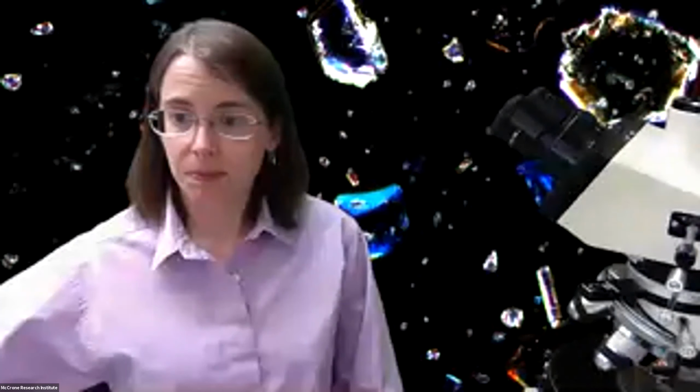Someone asked, for the round circles with the correction fluid, could you use a stencil? I mean, you could. I haven't tried. It's certainly worth a try. But what I would say is definitely make a variety of them, because there's guaranteed to be some amount of trial and error with it, but certainly you could try with a stencil.